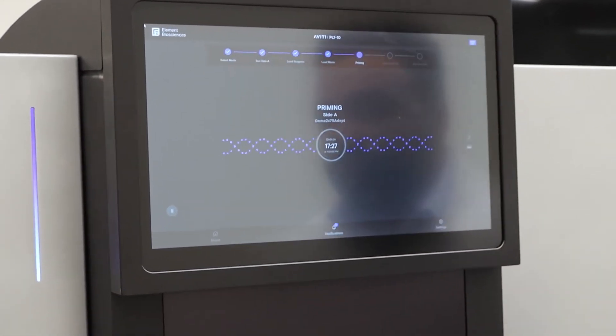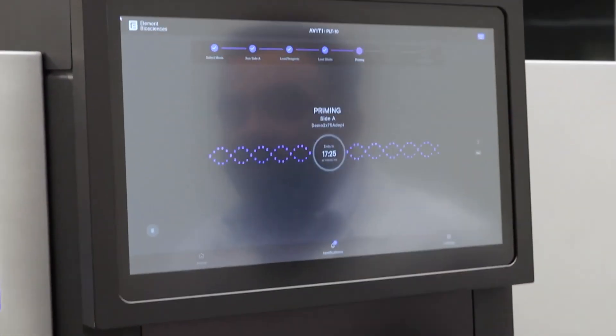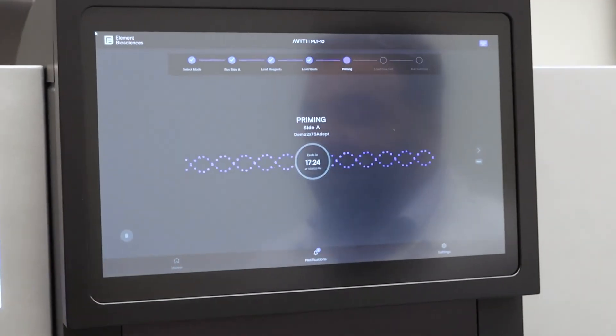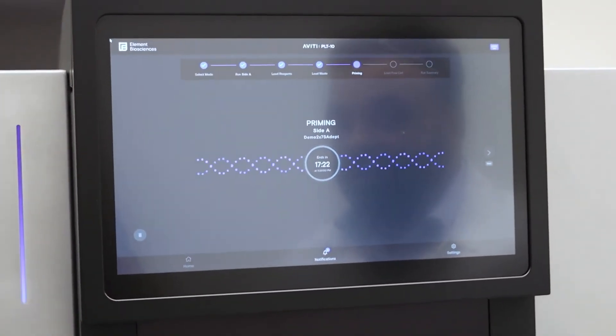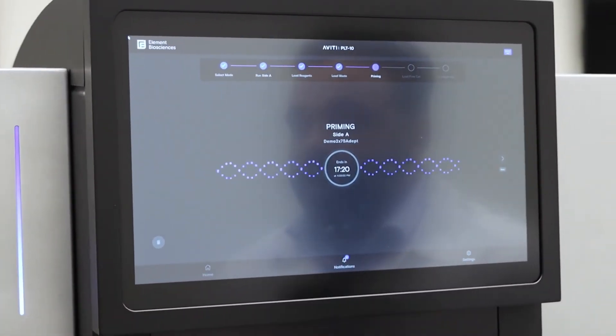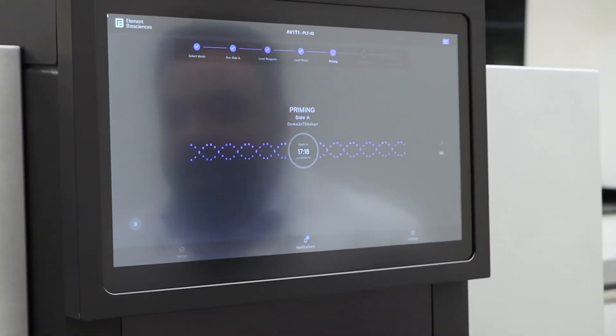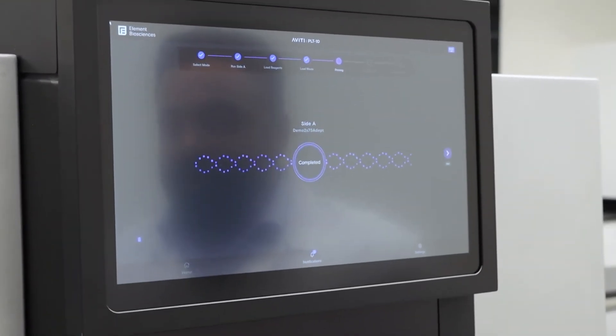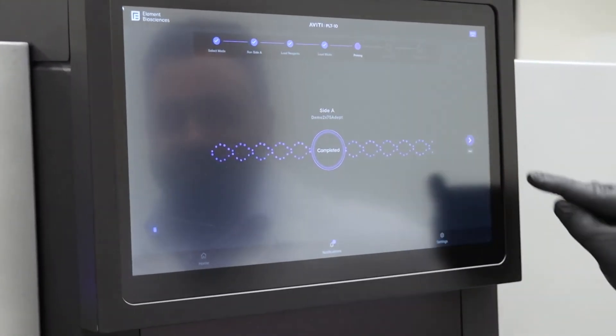At this time, the system will prime, filling, removing all air, and setting up the configuration for the run. This will take about 15 to 17 minutes. This time, this is a demo, so it will be a lot faster.